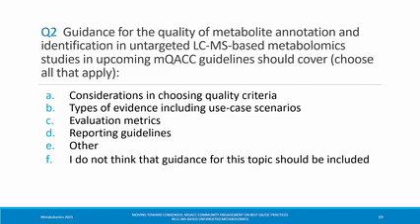So it's MS3, 4, 5, 7, 9, depending on where we can actually stop, what's the limit of the visibility in the machine. And we usually cover a wide range of energies, starting from, let's say, 5 to 100, every 5 or 10, depending. That's how we do it. Thank you.